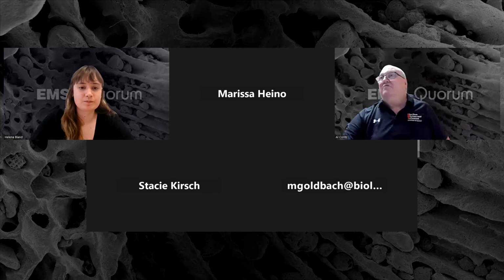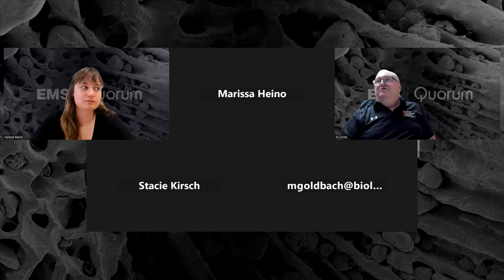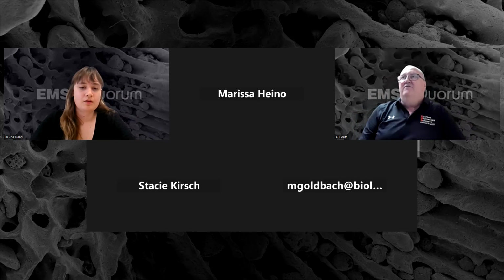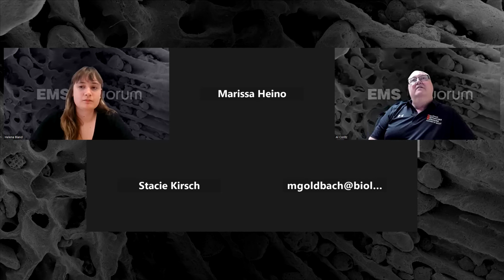All right, thank you. Next question. Would you comment on plasma cleaning, glow discharge versus UV ozone cleaners in regards to surface activation and wettability?